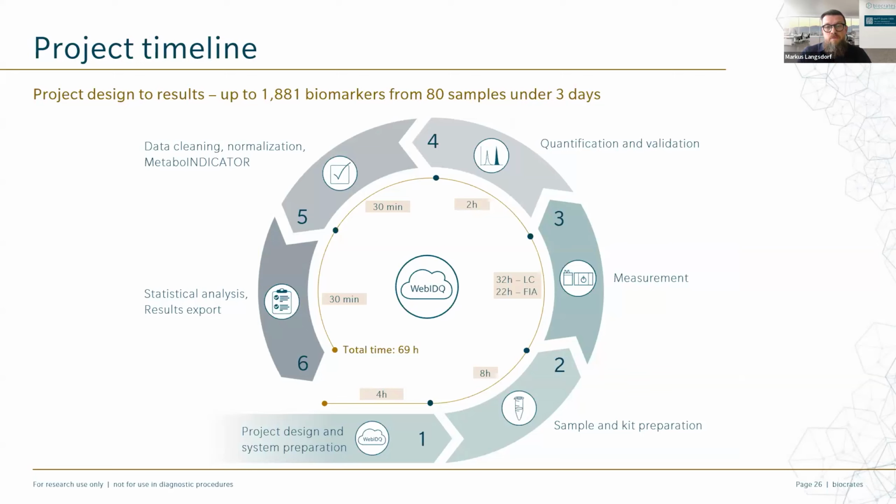And then you do the quantification and validation in WebIDQ, so the whole data processing, and you can check the peaks and the calibration curves and the validation and the performance results and so on. And then finally, what you can also do in WebIDQ is data cleaning and imputation, data normalization, using the metabolic indicator as just mentioned, doing statistical analysis, and finally export the results.